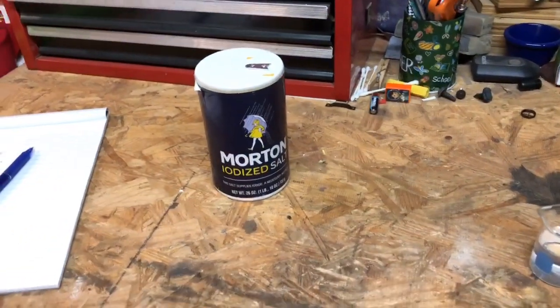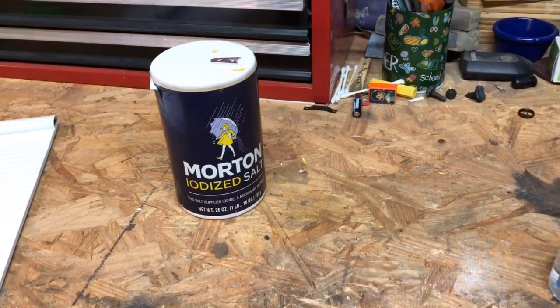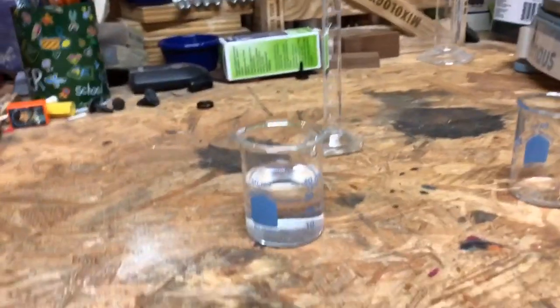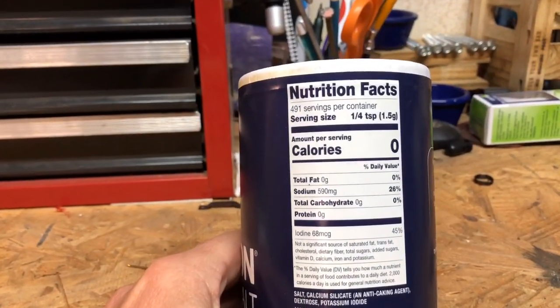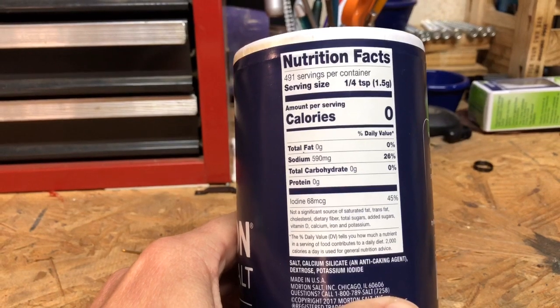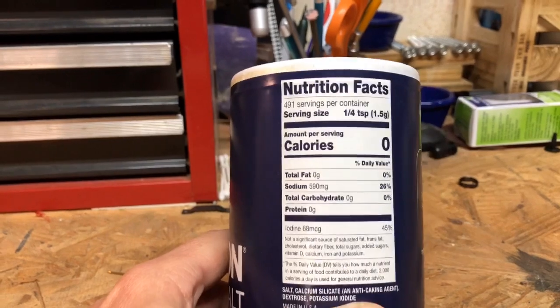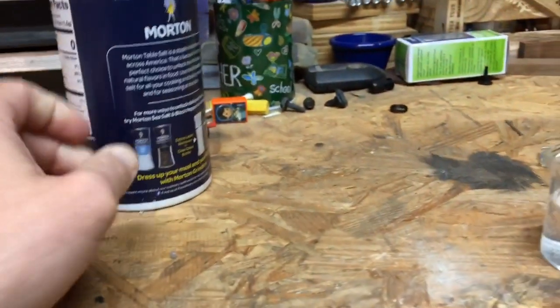Now, ideally, I would use something that was not iodized, right? Adding some iodine makes it not such a pure substance. But the goal here is to figure out how much salt is soluble, how soluble it is, and it's mostly salt. There's not a lot of iodine in here. If we switch over to the ingredients list, you can see it's a very, very small amount, coming in last on the list. This is by and large mostly sodium chloride.